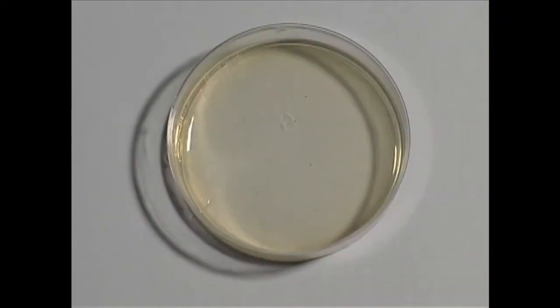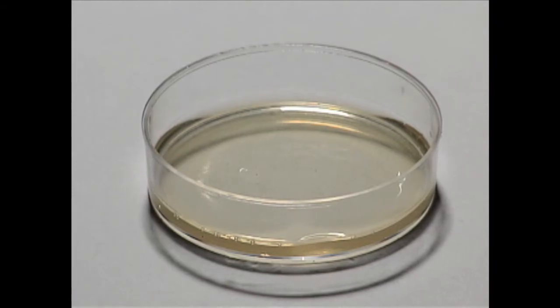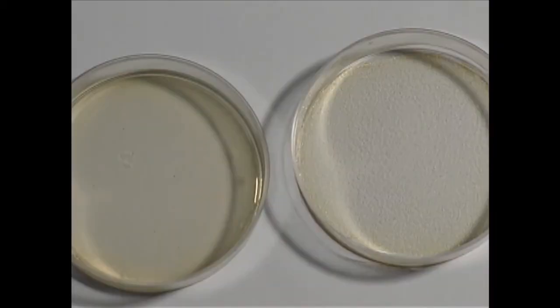Control-2 also lacked the PUC8 plasmid. Its agar was infused with IPTG and X-gal, and also the antibacterial agent ampicillin. The ampicillin should have killed all these cells, resulting in no growth. If any growth has occurred, it will have been from cells that are naturally resistant to ampicillin. They should be few and white.